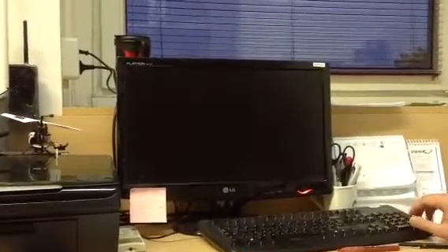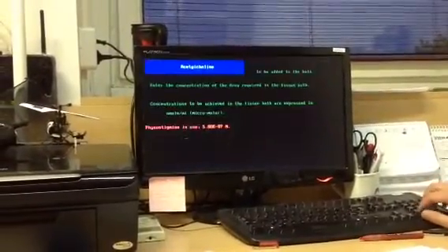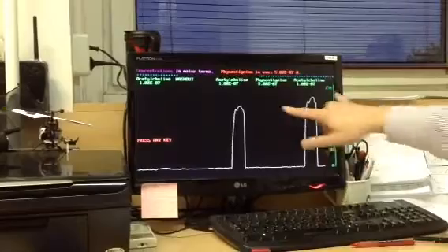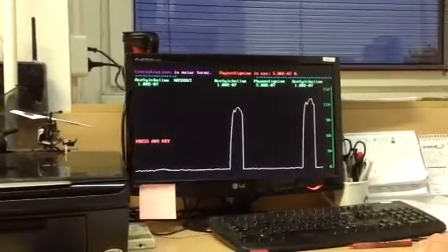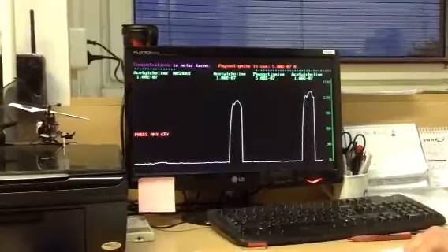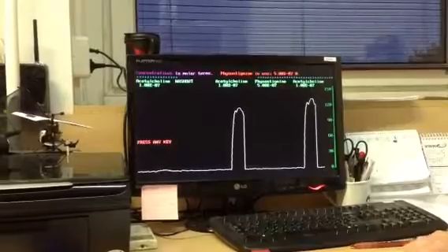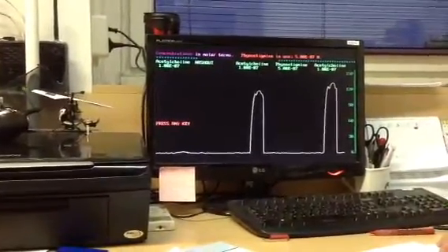But when we add the same concentration of acetylcholine again, in the presence of physostigmine, the peak of the contraction of acetylcholine is higher. So we demonstrated that in the presence of physostigmine, acetylcholine causes higher tension. That's all. Okay, the next topic. So this one has finished, right? Yeah, it was topic number 9.